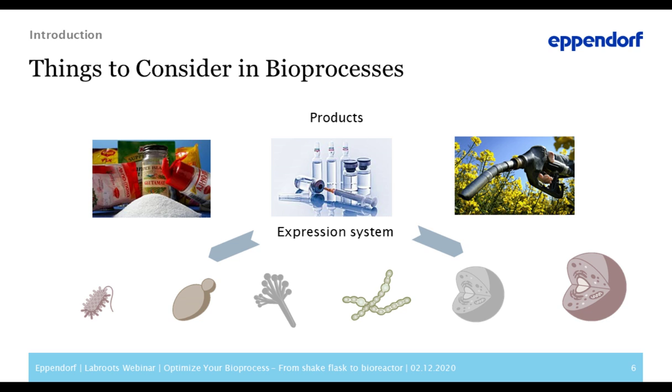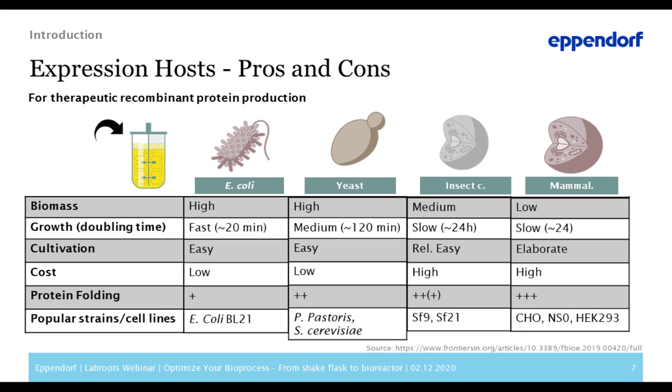So, yes, the first thing we have to consider is the expression host, so the selection of the proper expression host and system. As an example, we pick out here the typical expression hosts for therapeutic protein expression. So let's have a comparison of pros and cons.